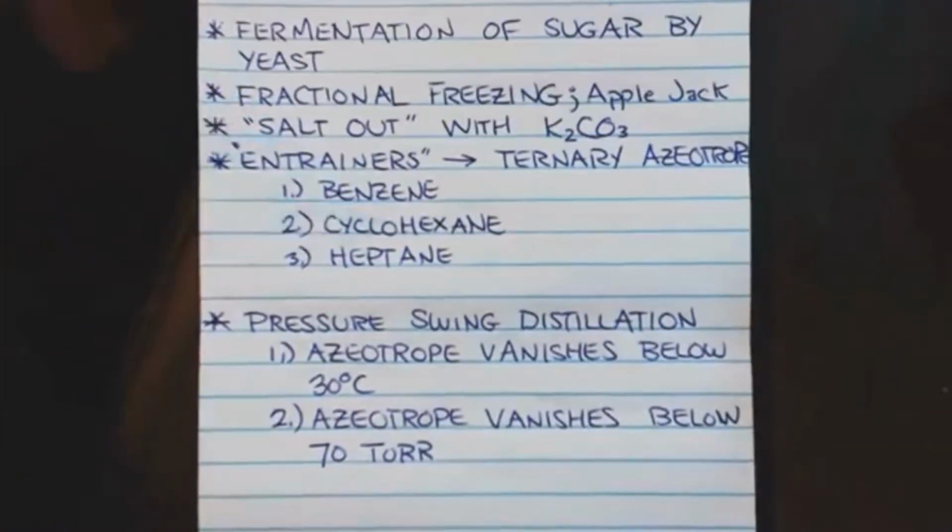That's basically what they're doing with Applejack to make it more pure beer, more alcohol in your beer. I don't suggest that either, but it's a good experiment. I'd like to try it. I've never tried it. Another way, which I've never tried, is salting it out.